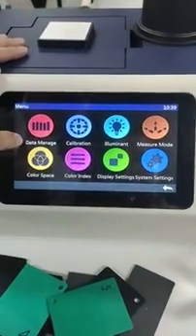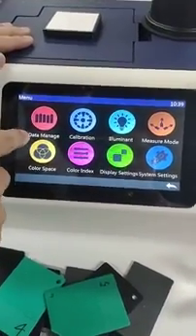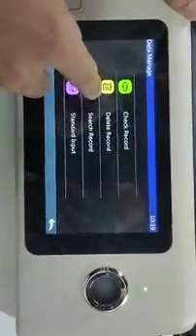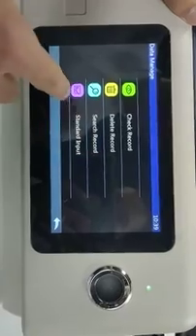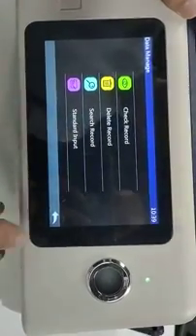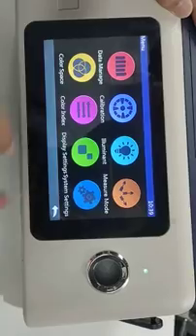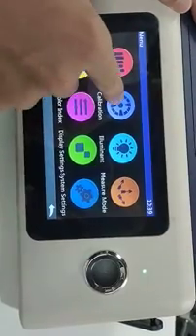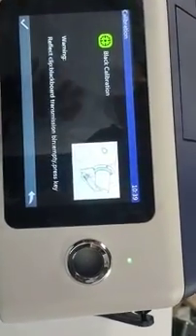First, data management is for the data management. You can check record, delete record, search record and input standards. Second, calibration. Of course, it's for white calibration and black calibration.